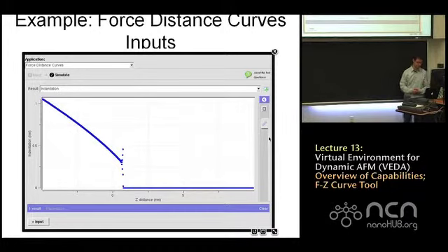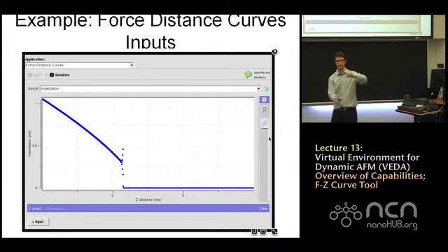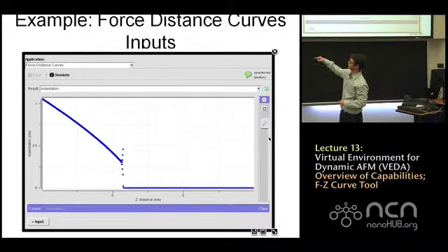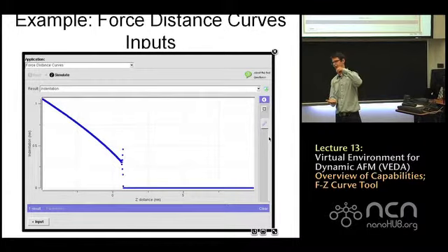And finally, from the drop-down menu, select indentation. This plots how far the tip has penetrated the surface into the contact forces. It is zero when we're far away from the sample, but as we approach, it jumps up to a positive value, and that's what happens when the cantilever snaps into the sample. There's a discontinuous jump in that indentation curve. So we don't start at indentation equal to zero, because of the snap-in: we were already indenting the sample when the tip contacts it.